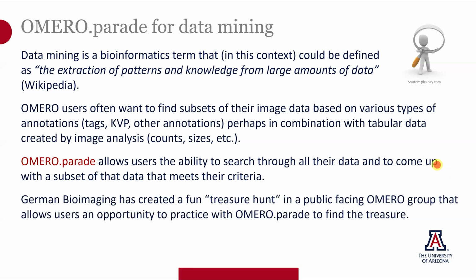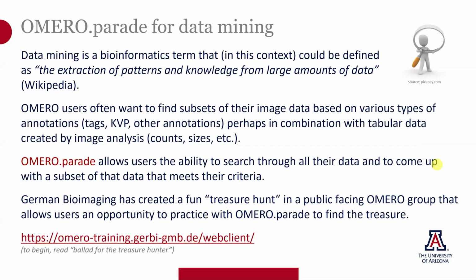But if you're interested in learning how to find things in OMERO, the German bioimaging group has put together a bit of a treasure hunt using a public-facing OMERO group, so no login required, that allows you to practice using OMERO Parade, and I've included the URL here, and it's also available in the notes below.